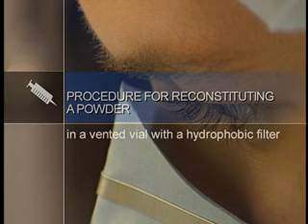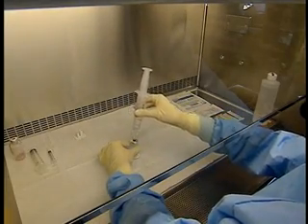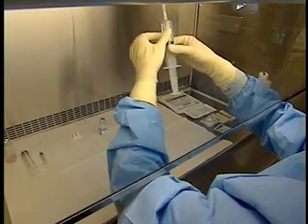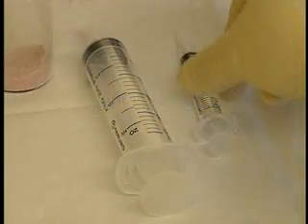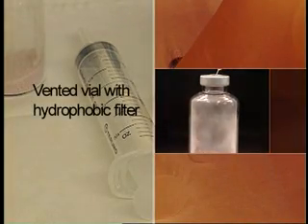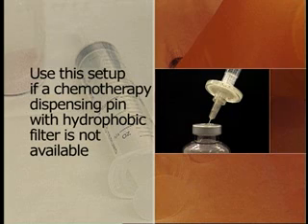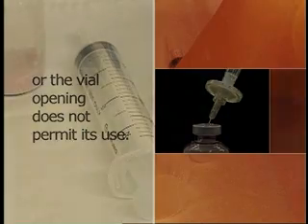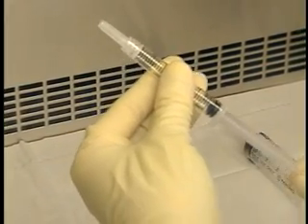Procedure for reconstituting a powder in a vented vial with a hydrophobic filter. Begin the procedure by drawing up the diluent into a syringe. Pull back the plunger of the syringe before attaching the filter so as not to damage the filter by accidental air pressure.